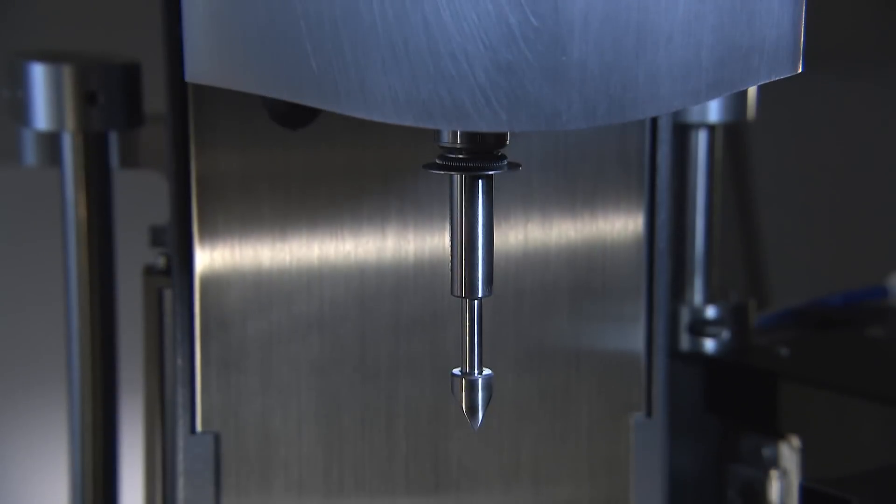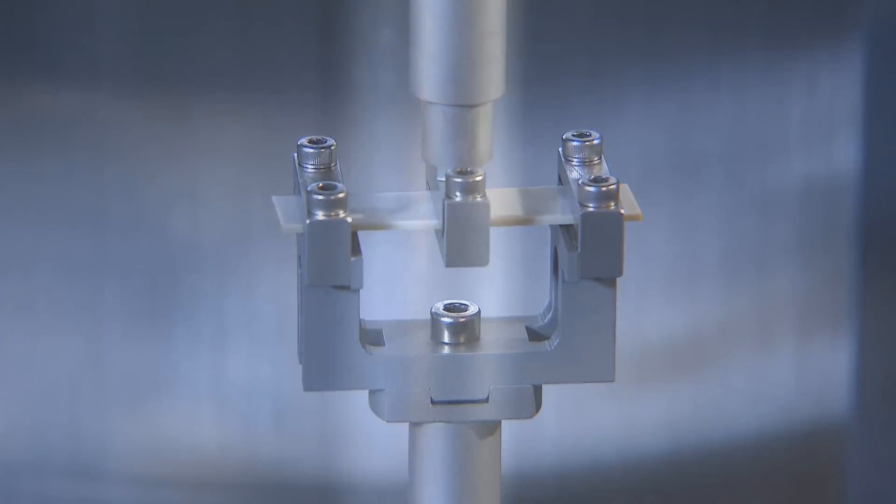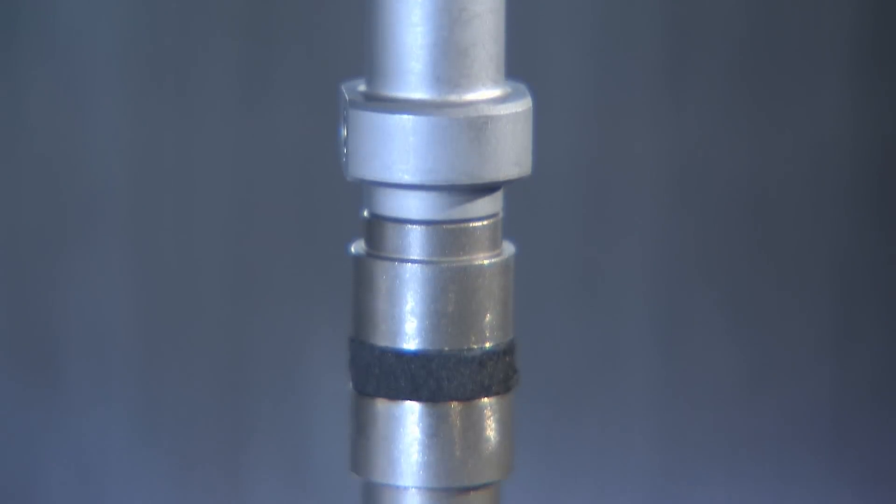The RSA-G2 features a variety of highly rigid stainless steel sample clamps to accommodate multiple modes of deformation and the widest range of sample stiffness.